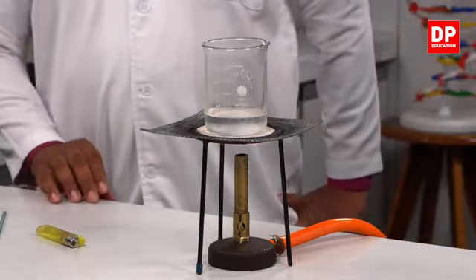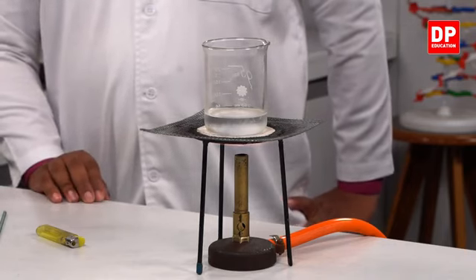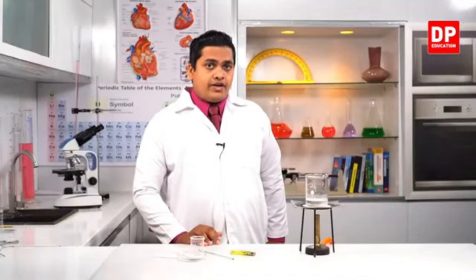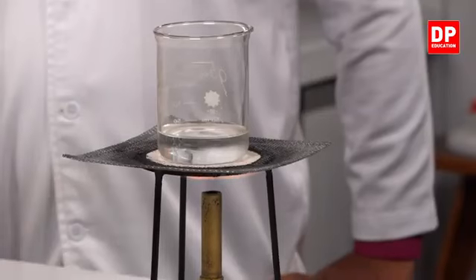So let's observe what will happen in the end when I am heating it. We'll take somewhat of a time because we need to evaporate all the water in the beaker in order to get our necessary observations. So be patient and observe what will happen to the beaker when vaporizing the water.